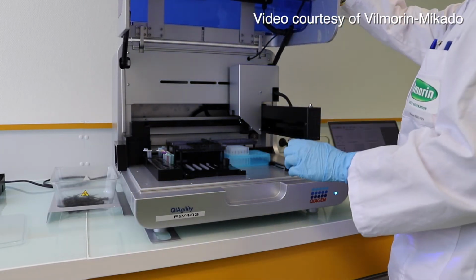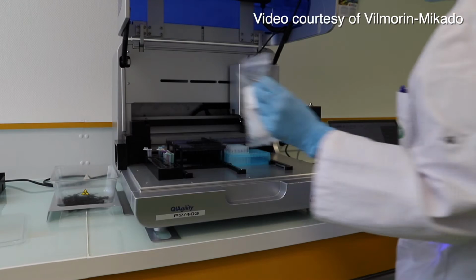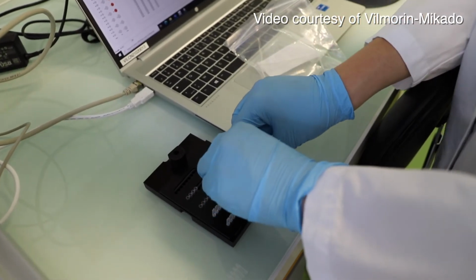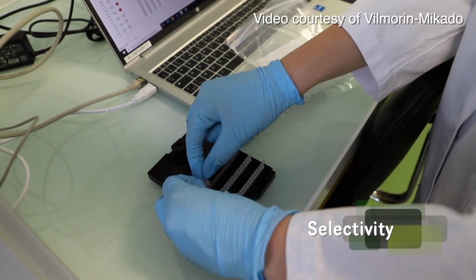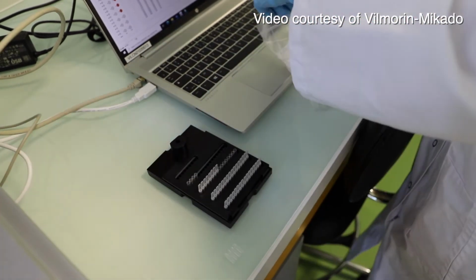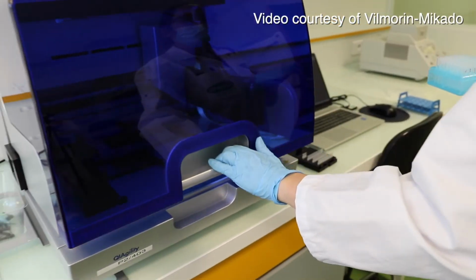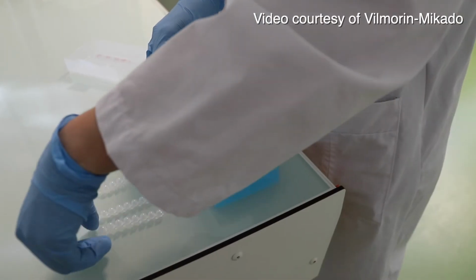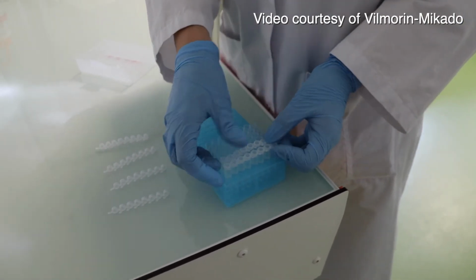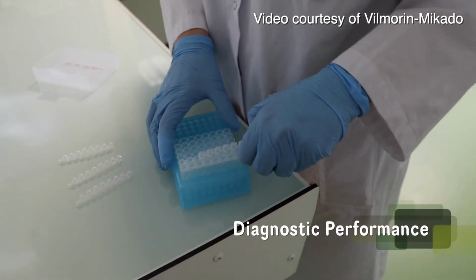We also assessed the analytical sensitivity, but this parameter was not critical because we isolate the strain before identification, and the quantity of the target is not a limiting factor. We verified the selectivity to see if there was a matrix effect, and with the robustness evaluation, we showed that we could change some parameters such as the PCR equipment without modifying the results. So we showed that this assay was robust. And during the comparative test, we evaluated the repeatability and the reproducibility and also the diagnostic performance.